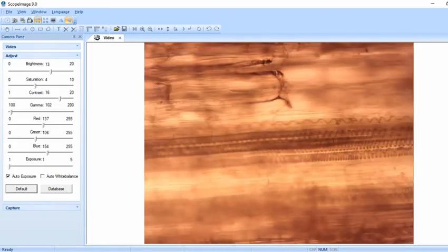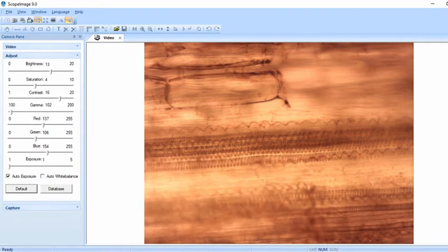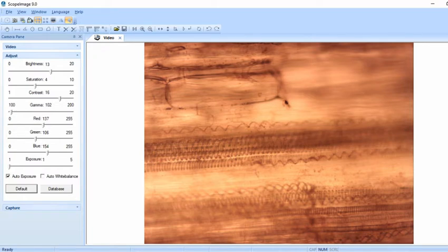But they're really cool. I've been looking online, and I can't quite figure out exactly what these are. I put them on Twitter. I'm hoping to find a botanist who can help me out, because I honestly have no idea. I am not a botanist. I do not study plants very much. I like plants, but I don't study them in depth. But this is really cool, and I wanted to show this on a video because it's fascinating. And this is why biology is so great.